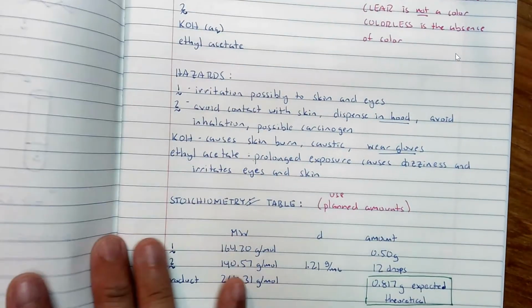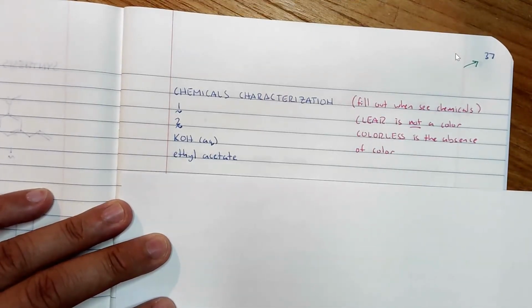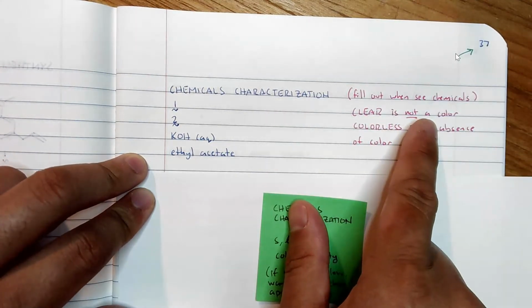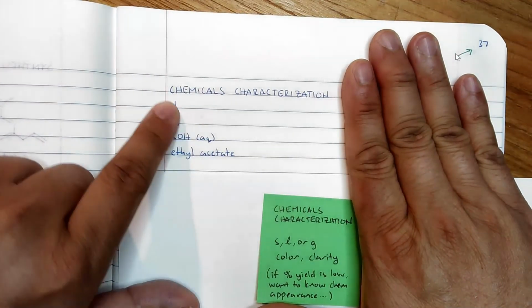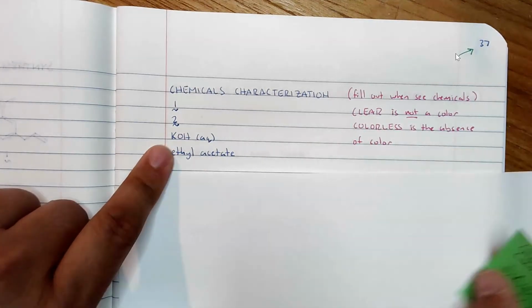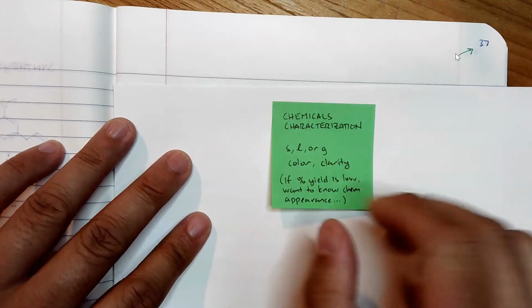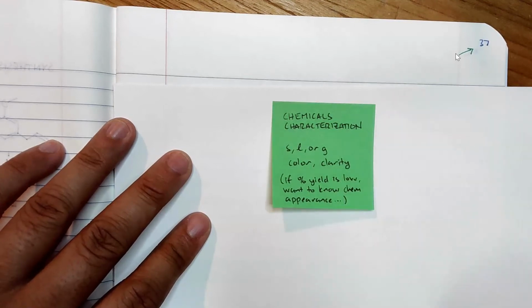Alright, next. Chemical characterization. For the chemical characterization, list all the chemicals you'll be using, and you're going to fill this out when you see the chemicals. So this will be blank at the beginning of lab. You'll have it set up, but then you're going to put in the characterization. You want to tell your instructor whether you're working with a solid, liquid, or gas. What is the color of that substance, and what is the clarity? Is it transparent? Is it partly cloudy?